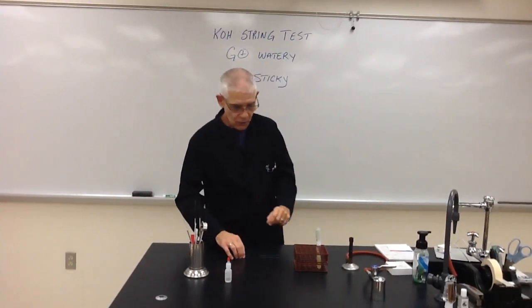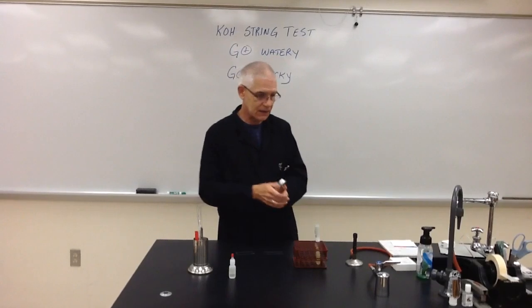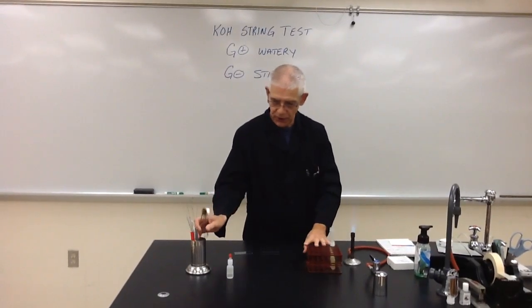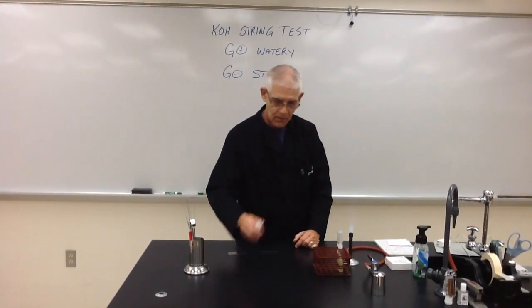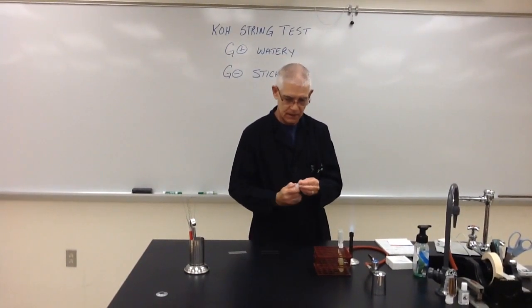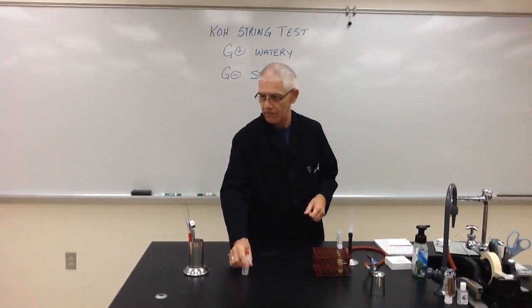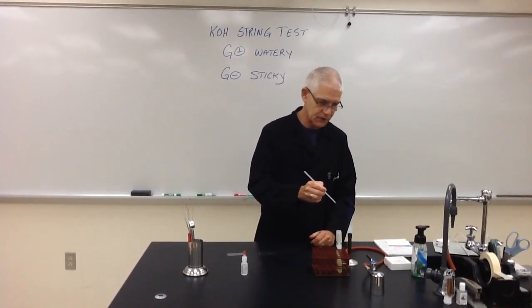So the first thing that you want to do is, as always, use good aseptic technique. So get your Bunsen burner going. And then what we're going to do is we will first start out by adding 1 drop of the 3% potassium hydroxide. So that's KOH. Just add 1 drop in there, and we'll start out by using the gram-positive first.